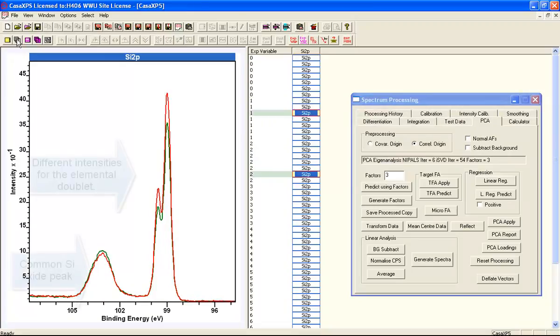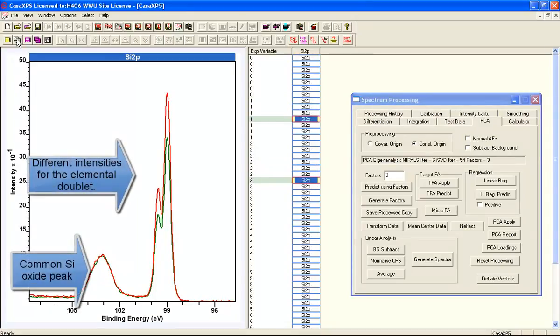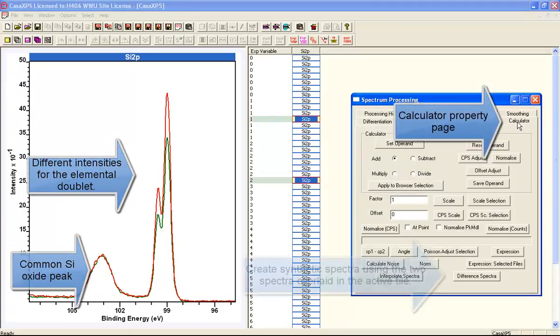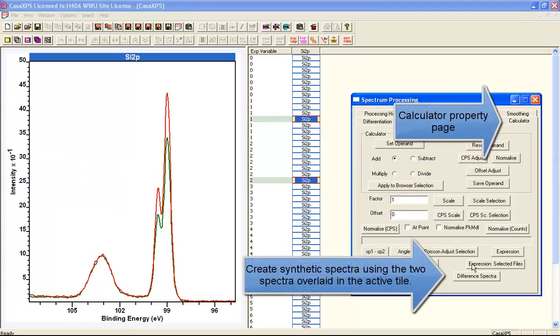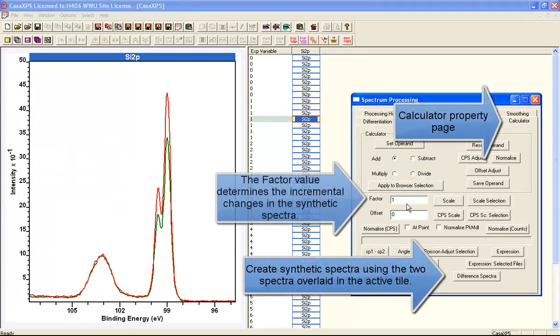If we use the raw data, the noise when you take difference spectra tends to be amplified. So we really need to remove as much noise as possible before we attempt to do these difference spectra.